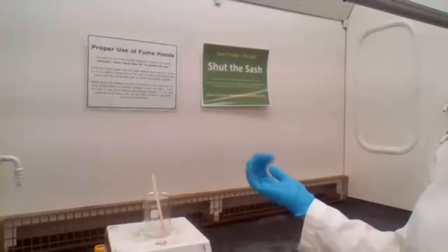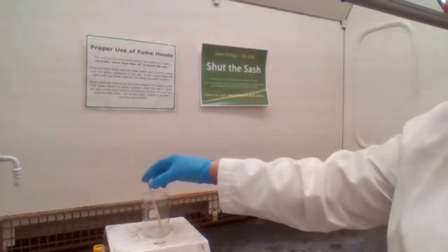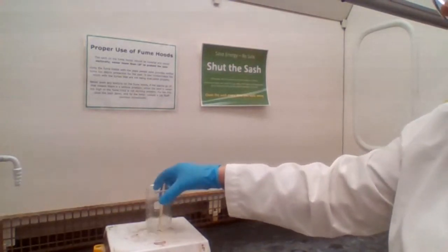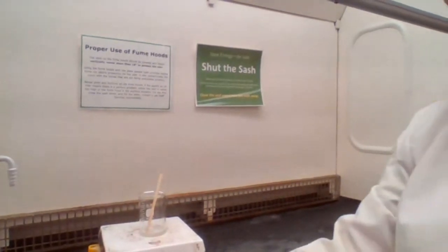But as the ether is evaporating, the product is a light yellow or tan color. So when your product gets a tan color, that's another indication that the ether is gone. And then the volume also.